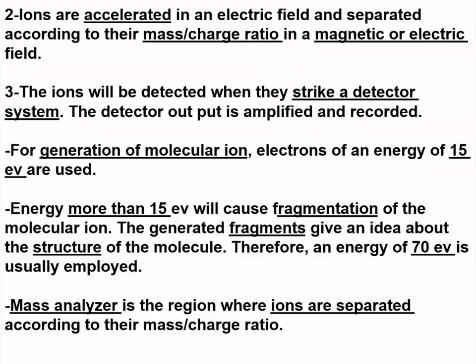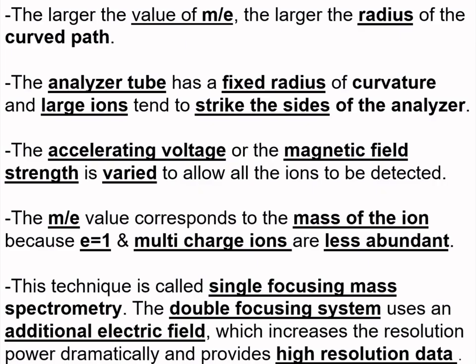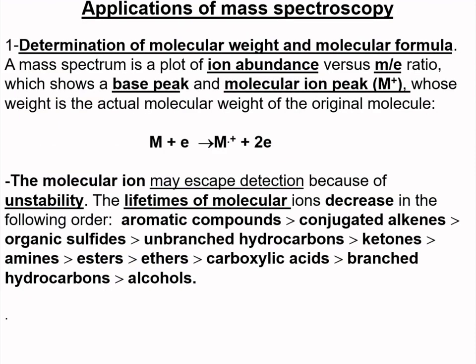As you see, the radius of this path is directly proportional to the mass over charge ratio.